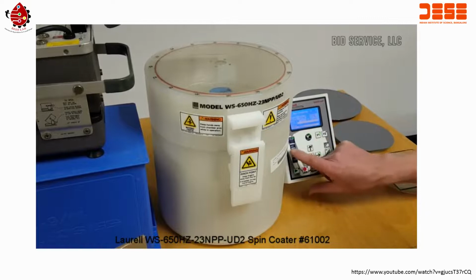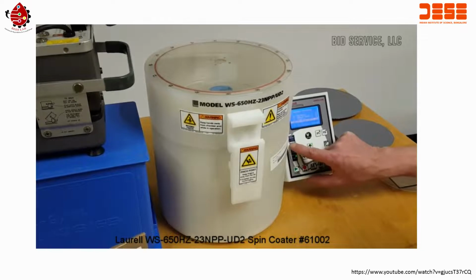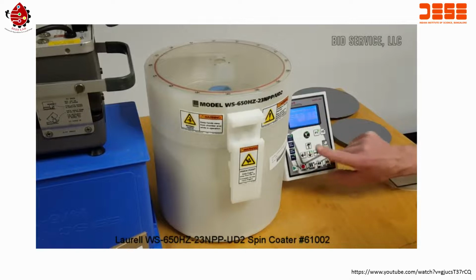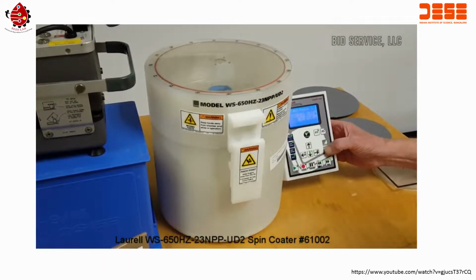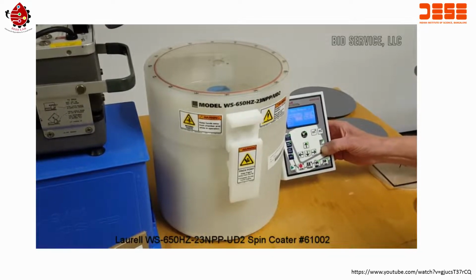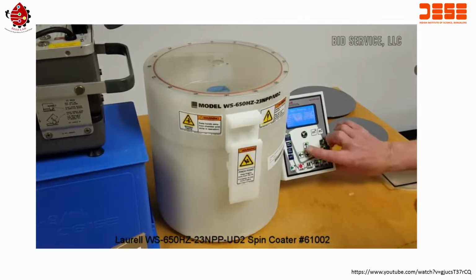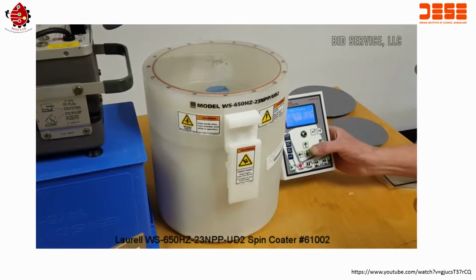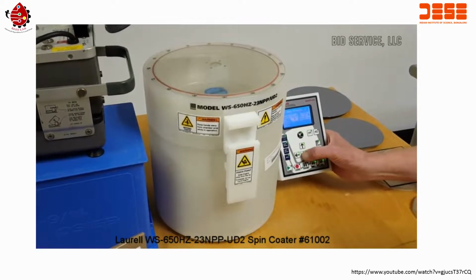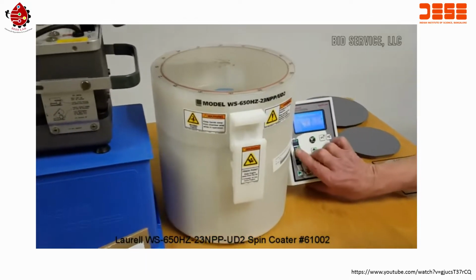I'm going to call up a program here, program 4, and what we'll first do is change the spin speed to, let's say, 4,000 RPM. There we go.